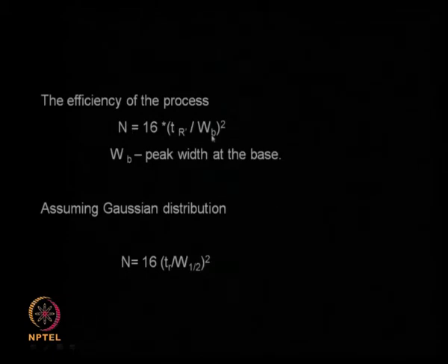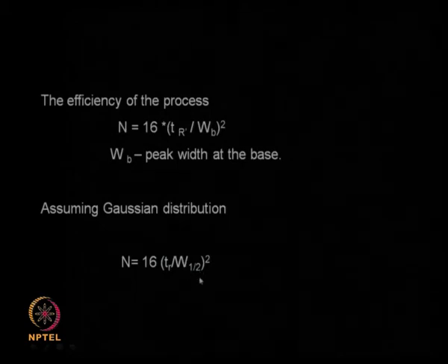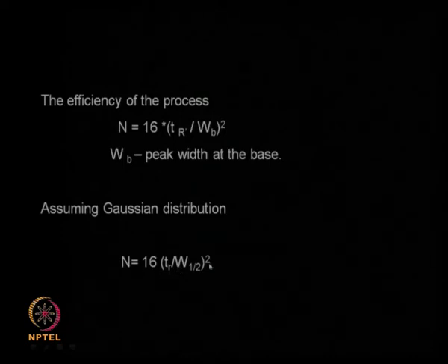Instead of looking at the peak width, I can look at the width at half peak height, that is called W half. Then I can use that equation and also calculate the number of theoretical plates.